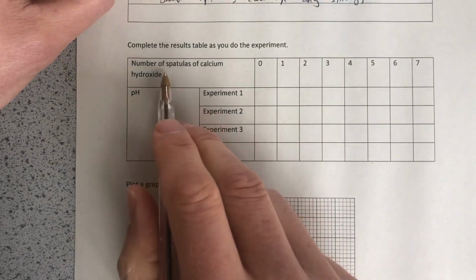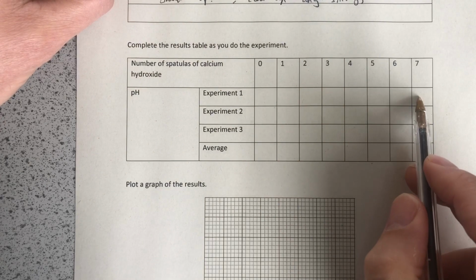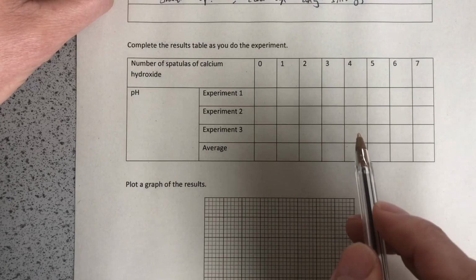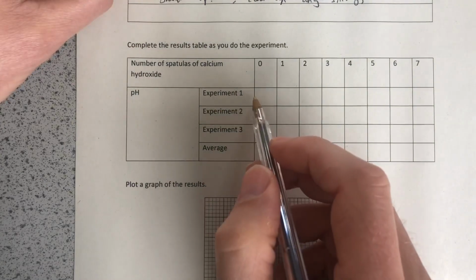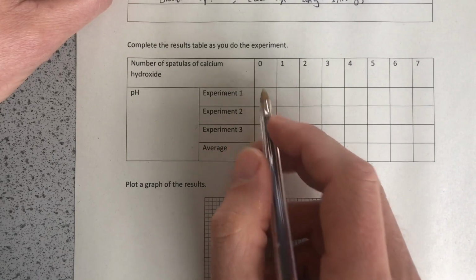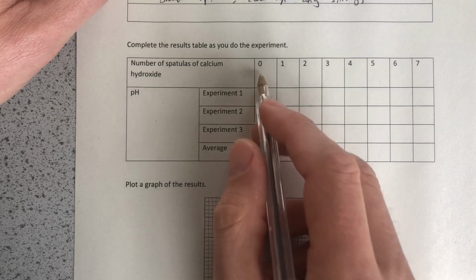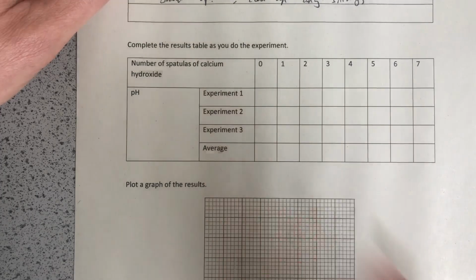Right, let's get on to this practical. I've got my results table here. I'm just going to do one experiment in the interest of time. You're going to do 3 and average them out. Okay, so to start with, we're going to do experiment 1. I'm going to measure out 50 centimetre cubed of acid, and we will add some universal indicator and record the pH on the table.